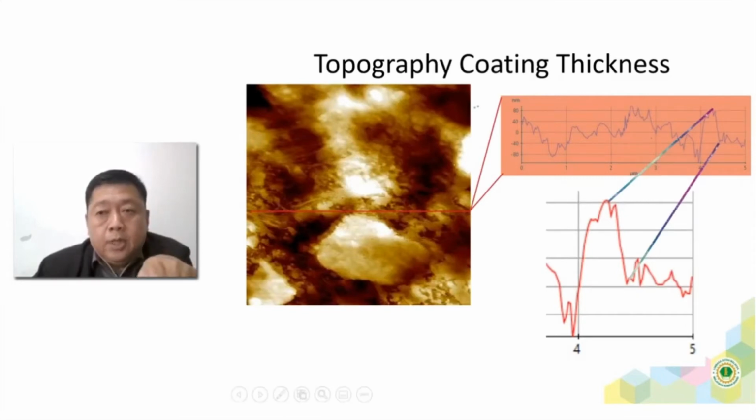As you can see from this image, this is a 2D image, and you can see a big, huge particle here. These are foreign particles.